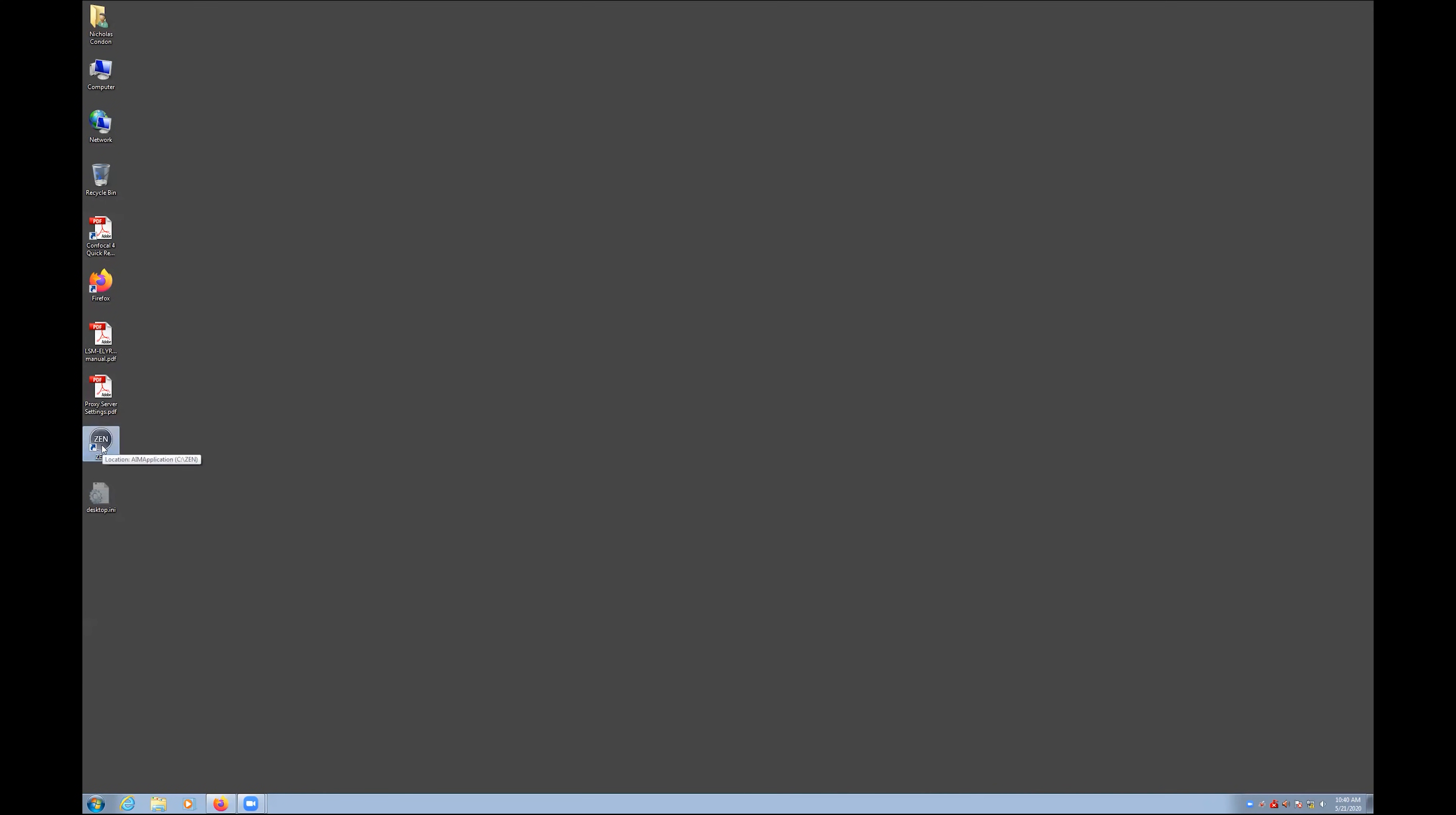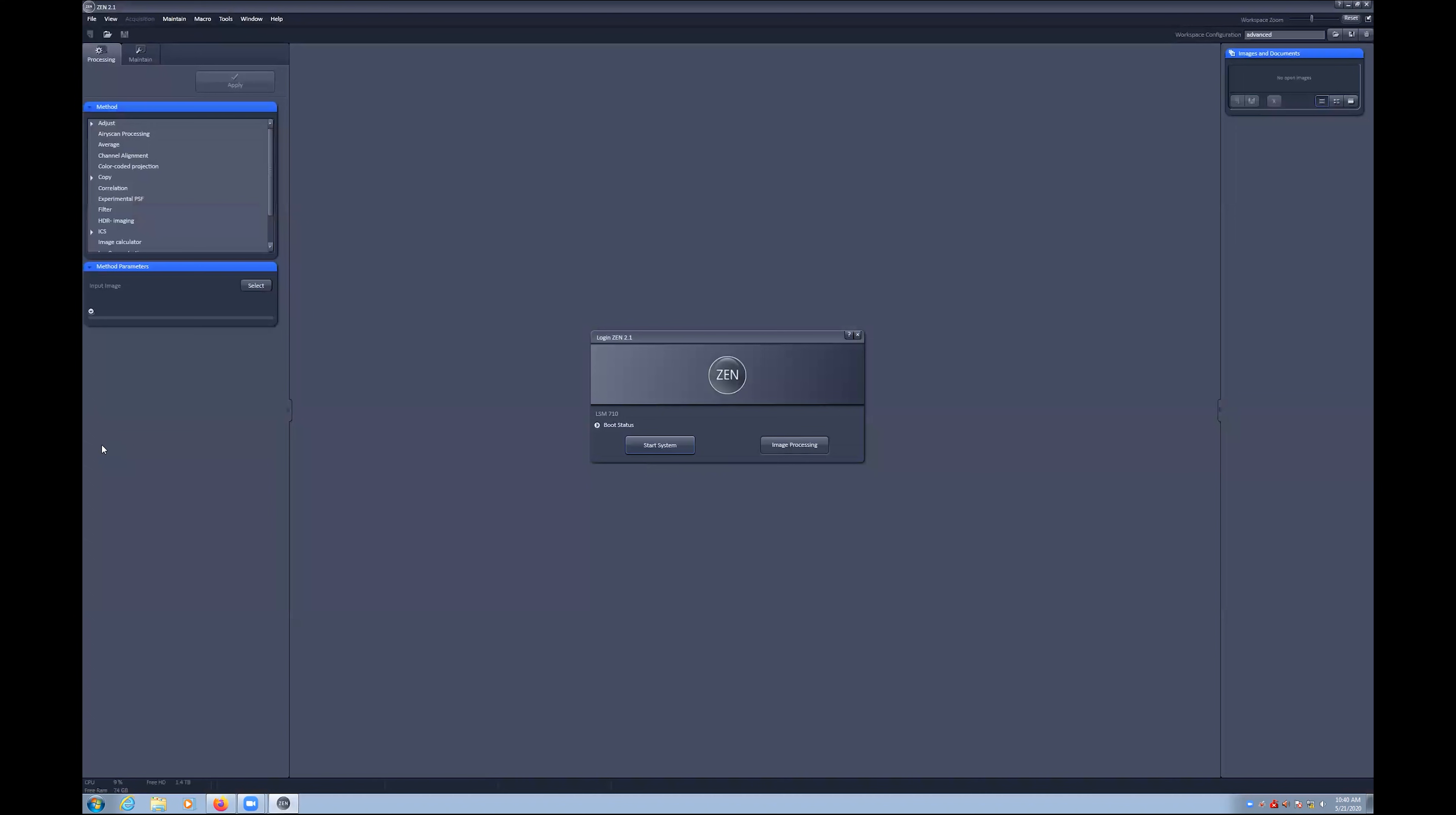To start the software, double click on the desktop icon for Zen Black. Once the program opens, then click the start system button to initialize the microscope. You can also open the boot status option to see the different devices connecting and initializing. The startup sequence can take a couple of minutes.